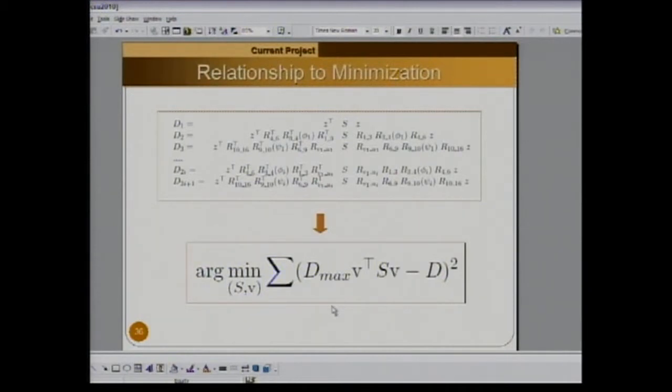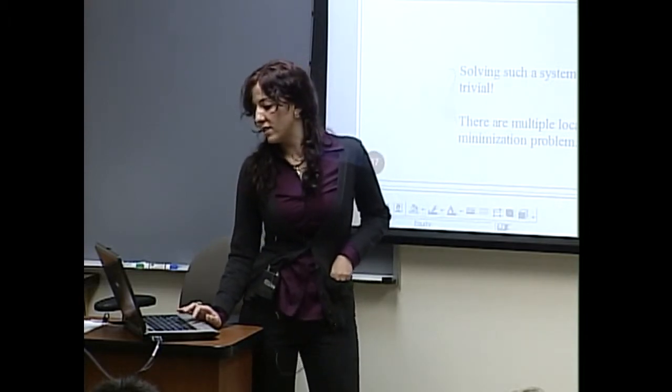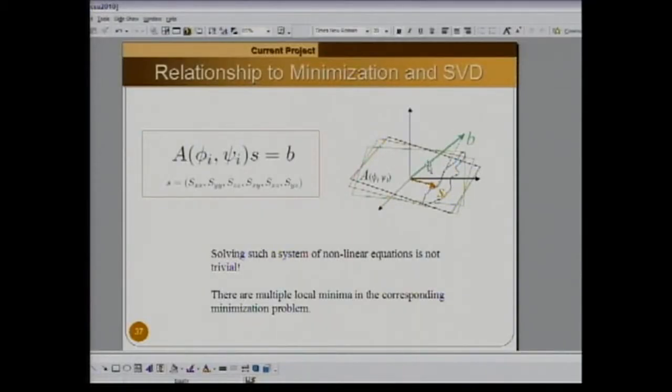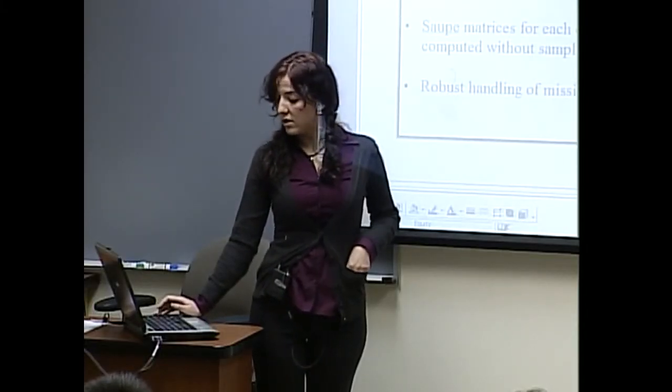And we minimize it using techniques which were also developed in RDC Panda, and this involves a little bit of algebra, but we found a nice way of finding local minima in this function. Unfortunately, it's not a linear system of equations anymore, so we don't have just a hyperplane in the RDC values space. It's a more complex set of hyperplanes defined quadratically through dihedral angles. However, I'll not show you how we minimize this function. They result in a least square function.